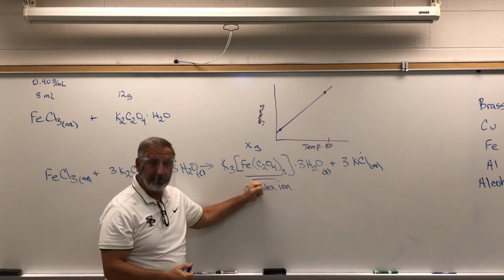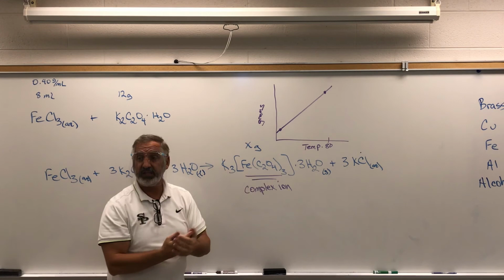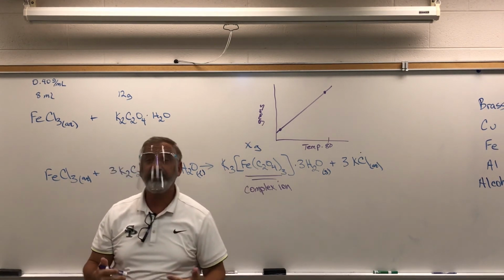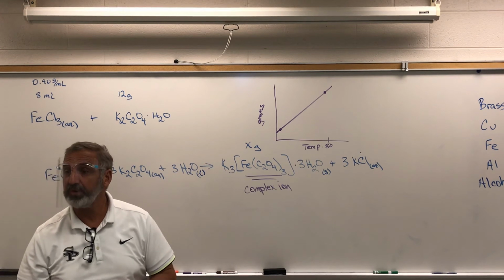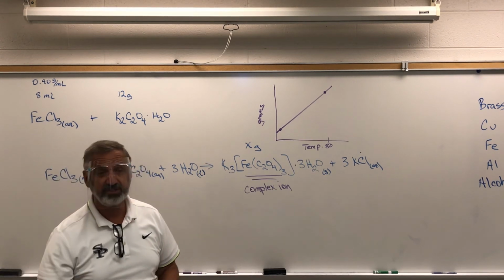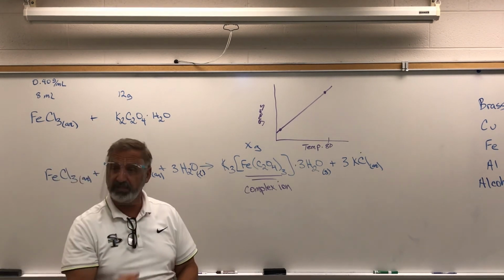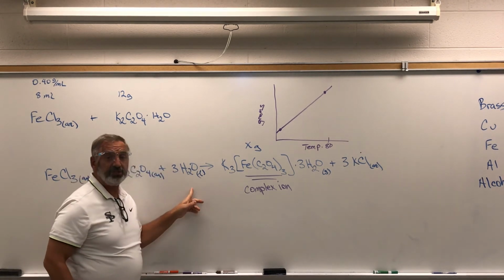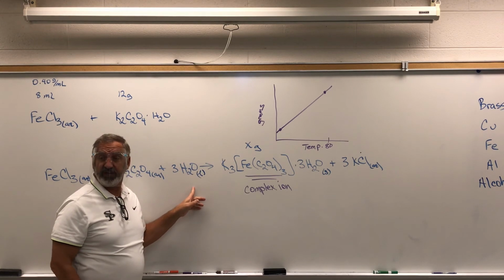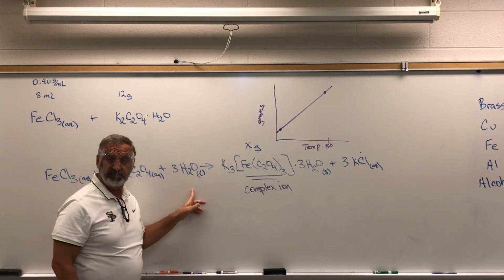So we're going to go through, heat up, dissolve it, add our 8 milliliters, stir it, put it into an ice bath, and then collect, and then it's going to solidify. Then we're going to filter it. We're going to use vacuum filtration. I'll show you how that works in the lab. Okay? Rather than just letting gravity, it'll just suck it through. It goes way faster. Then we're going to try to purify it through the process called recrystallization.